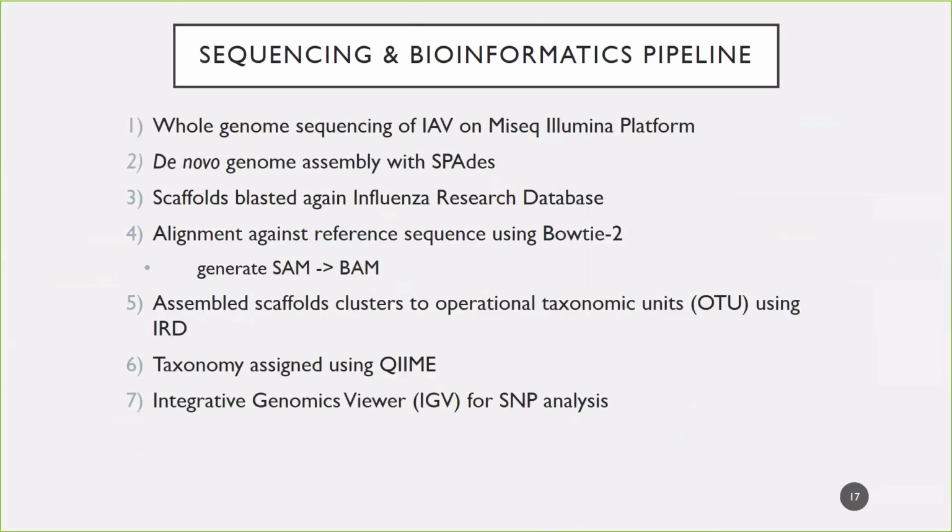I'm not going to go over the bioinformatics pipeline that we used to analyze the samples in great detail, I'll just go over it briefly. After these samples were sequenced, we used SPAdes for our de novo genome assembly. We then blasted our samples against the Influenza Research Database and performed a reference-based alignment with Bowtie2. To assign operational taxonomic units, we used the Influenza Research Database, and we also assigned taxonomy using QIIME. Next slide.